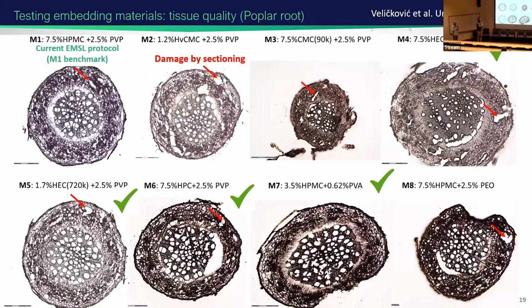Plants are composed of cell walls that are polysaccharide in essence, celluloses. So most embedding materials used for preparation of plant tissues are a kind of modification of cellulose, that polymer. There are different ways to prepare several different embedding materials and then try to section.